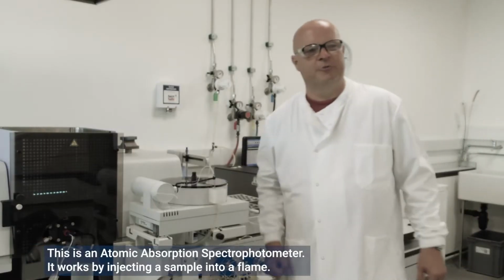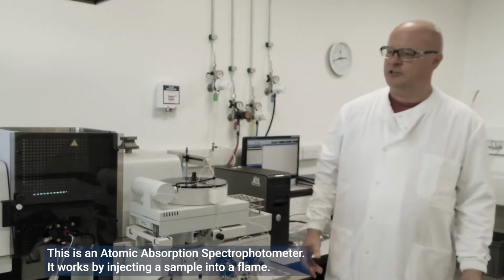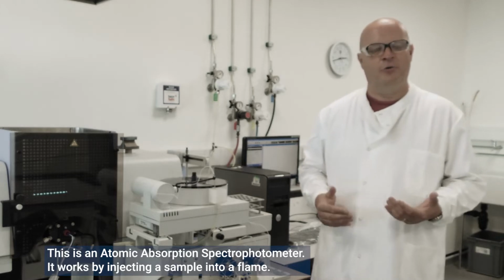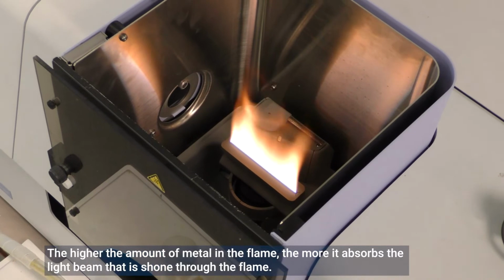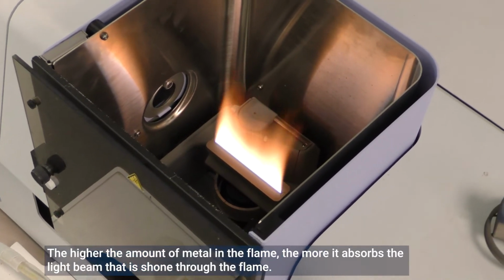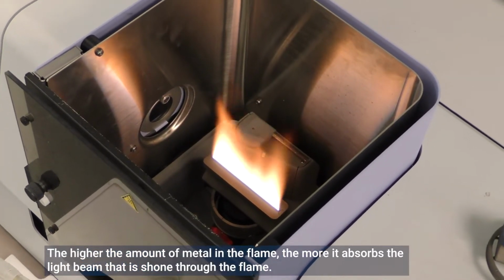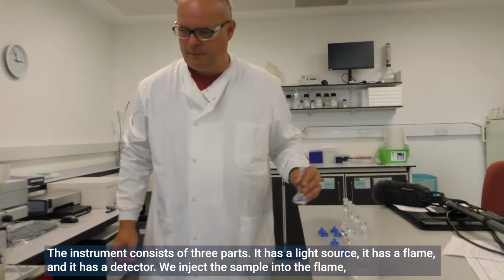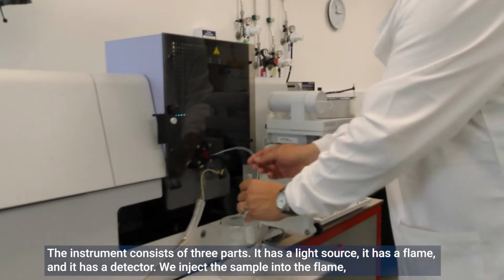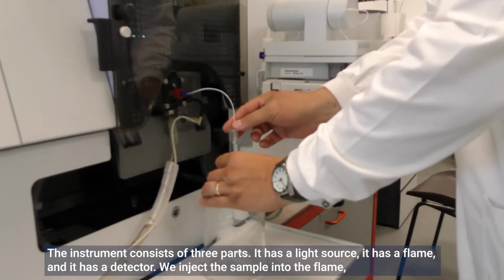This is an atomic absorption spectrophotometer. It works by injecting a sample into a flame, and the higher the amount of metal in the flame, the more it absorbs a light beam that will shine through the flame. So the instrument consists of three parts. It has a light source, it has a flame, and it has a detector.